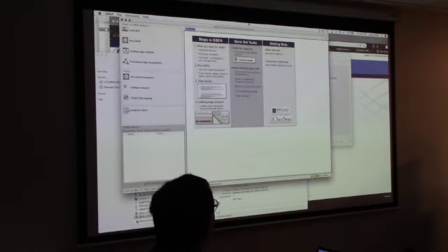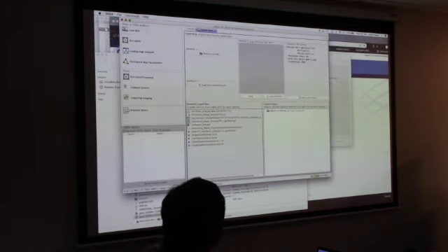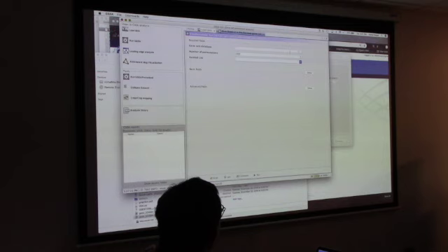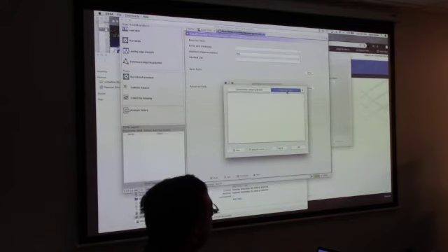Okay, so the first thing you want to look at here is there are multiple steps available here, including MSigDB stuff, but we're going to start by loading our data. Or even better, we actually want to run our GSEA Preranked, which is right here. In order to run this though, we need to first select the gene set database. When you click this, it gives you a list of all the gene sets that are available. Or you can load your own file of gene sets here.